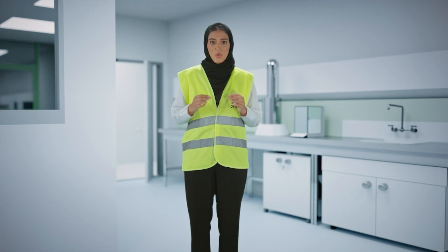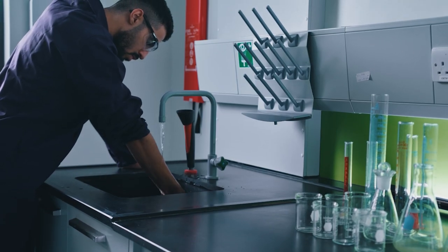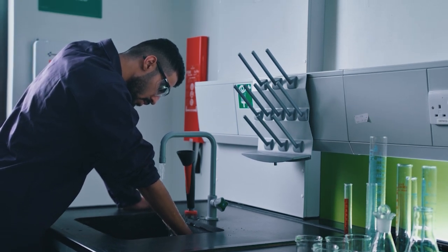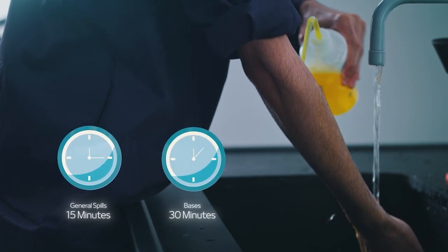The range and quantity of hazardous substances used in laboratories require prior planning to respond safely in case of direct contact with the chemicals. For a small liquid spill or splash that affects only a small area of skin, you should immediately flush the skin with flowing water for at least 15 minutes, or 30 minutes for bases.